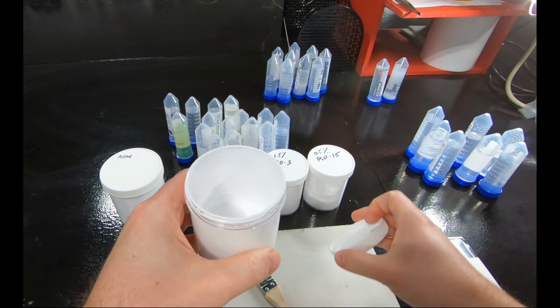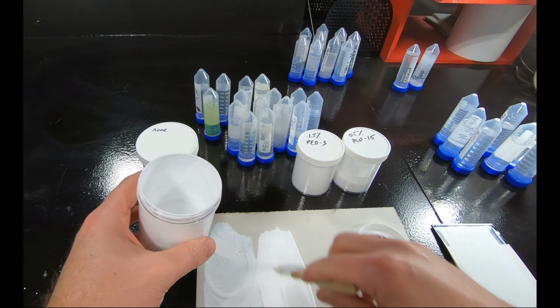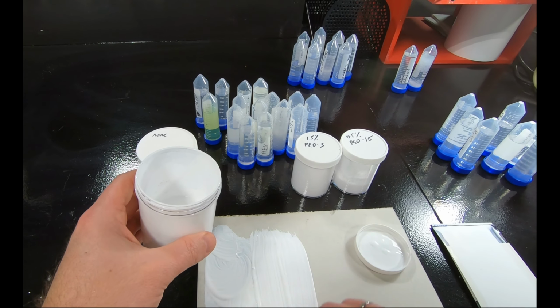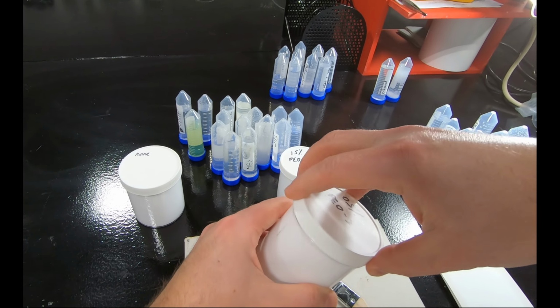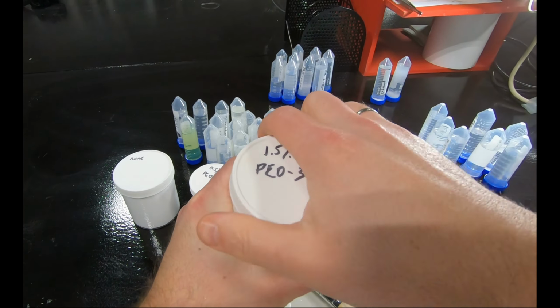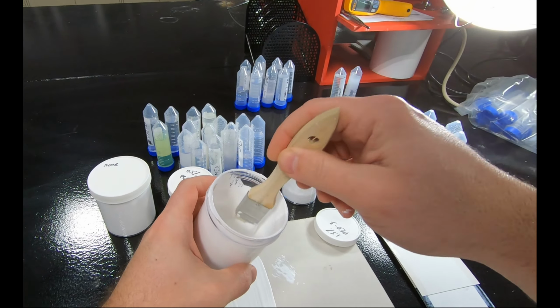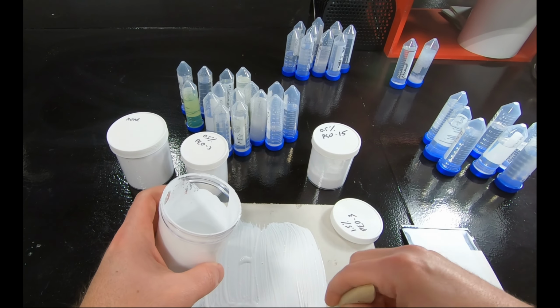I added 0.5% of PEO number 3. The percentage of the polymer I added based on total weight. As you can see, it has slightly thickening properties, and I decided to increase that amount up to 1.5%, and the viscosity changed slightly, as you can see.